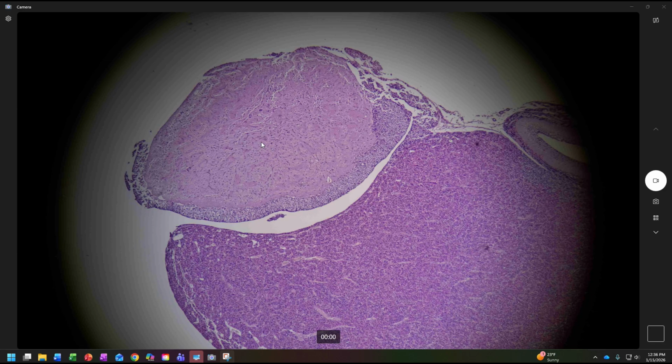If you remember back from Biology 121 or A&P I, in those first few weeks when we were looking at the different tissues, neural tissue or nervous tissue looked kind of wispy. And so this is the posterior pituitary gland because it's primarily neural tissue, and it's going to have that wispy, not as grainy looking appearance.